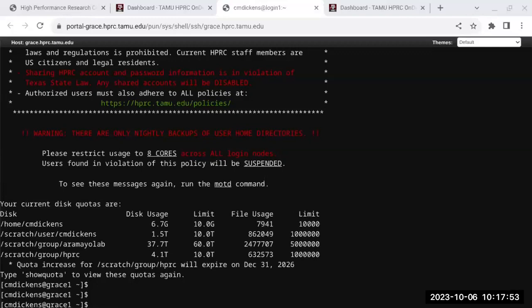You can see what's new. The iSeq is very small, like a printer, and that's interesting because if you have any problems with it, you just mail them your iSeq, and they mail you a new one. It's so small they can just handle it. They don't have to send out a serviceman to come look at your system. You just mail it in; they'll send you a replacement.